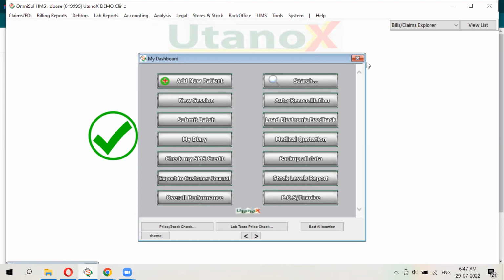Okay, fantastic. So this application actually comes in two options. It can be deployed on premises, that is on your own server, or it can be web-based. Depending on your preferences, it's essentially the same system, but what you choose will probably depend on your circumstances. I guess the decision is centered around whether you have a server or not. This one, because it's a desktop application, requires you to commit to an actual server that you keep running pretty much 24 hours and take care of things like regular backups, so that you protect your data.